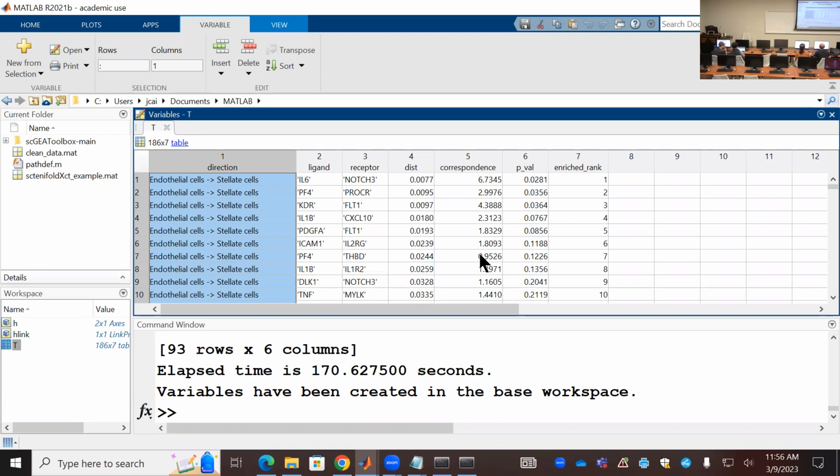Reduce the number of genes. So this in the experiment. Okay, there are top n highly variable genes. Oh, okay. You can say like 500. Okay, great. That will take a long time. Yeah, that will take some time. 500 will be just a couple of minutes. 500 should be fine. 500 genes definitely should work.